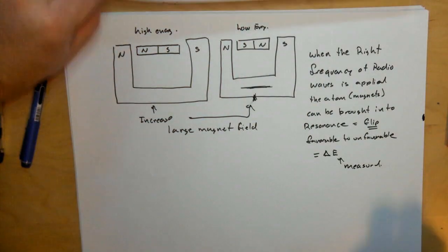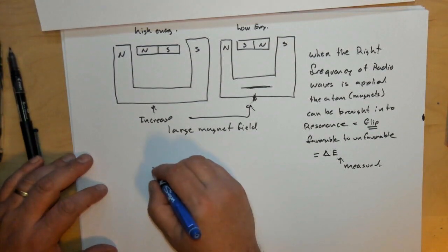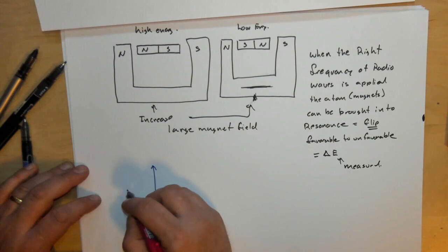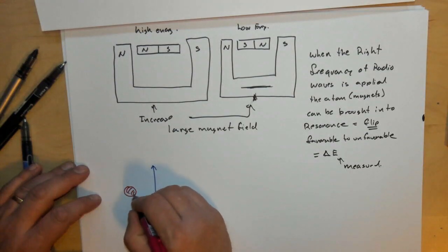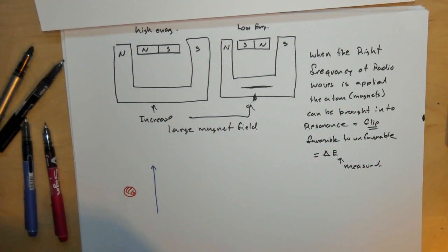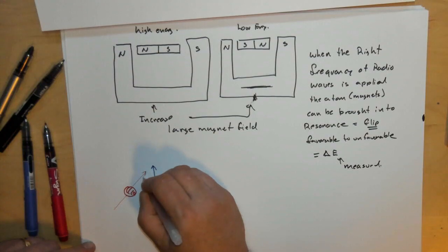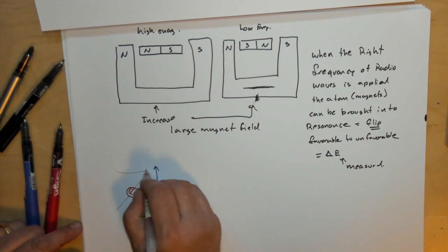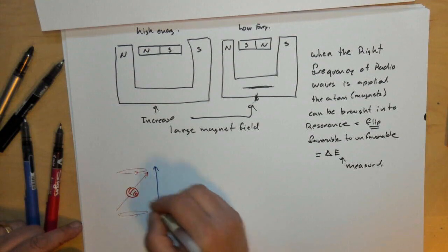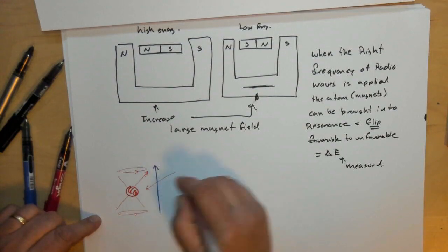Now, how is that possible? Well, if we do a little bit more theory here just for a second, we can say that, okay, if we have a real atom, and of course a real atom is not like a magnet here, it doesn't actually have the spin that we're talking about here. The resonance that we're talking about here is actually a specific angle that experimentally they have shown, and the resonance is actually its rotation about an axis here. So it creates a volume, and what you can do is get this to flip over, right? And this is actually what we call the spin.